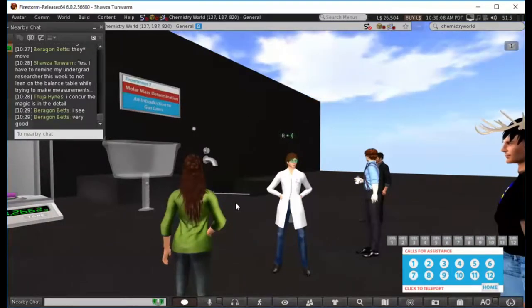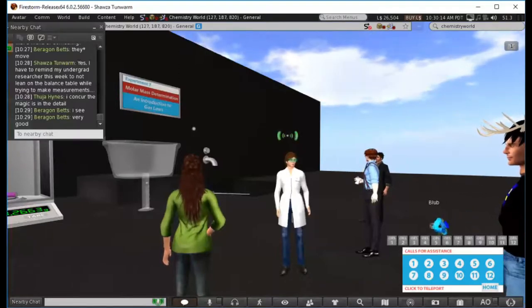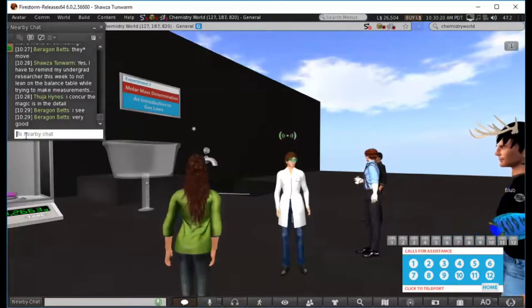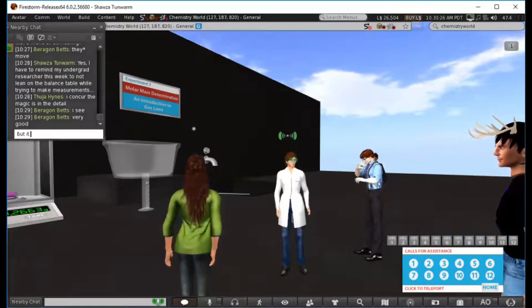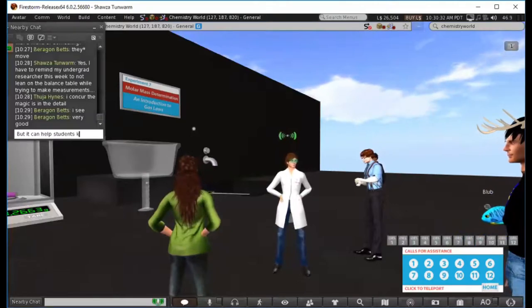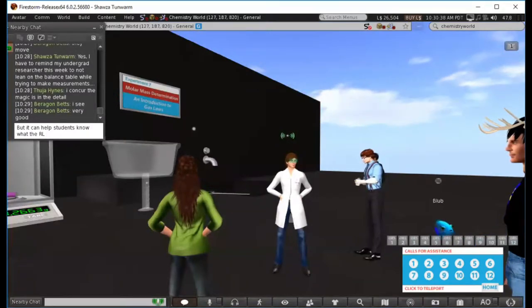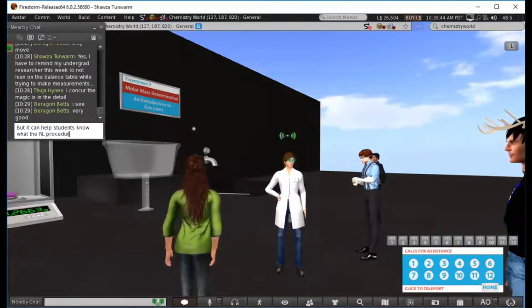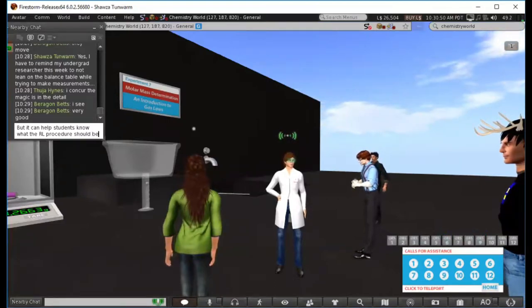The designers didn't know how to allow students to drag and drop objects with the mouse cursor to pick up an object and move it. So it was just sort of what we had to deal with. In some cases we did include a lot of options, most of which made no sense or were incorrect. So the students in some cases had to choose from a lot of options to do the correct step in the procedure. But in some cases, the choices were pretty obvious.